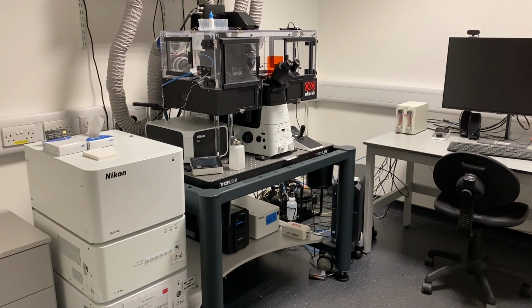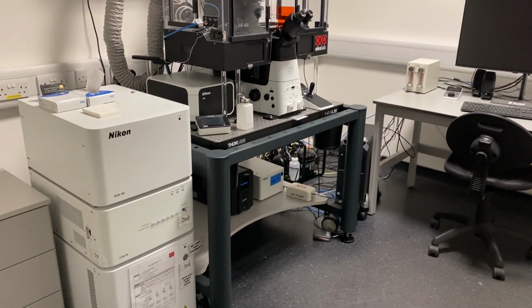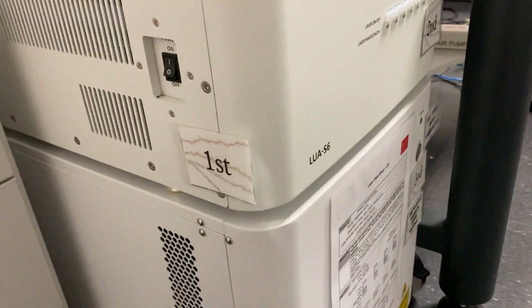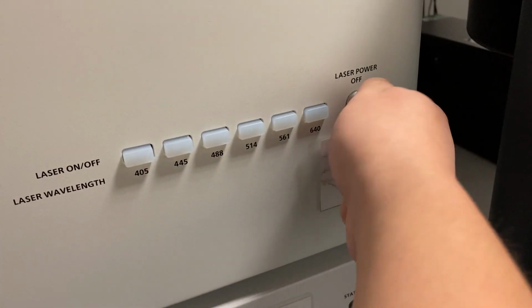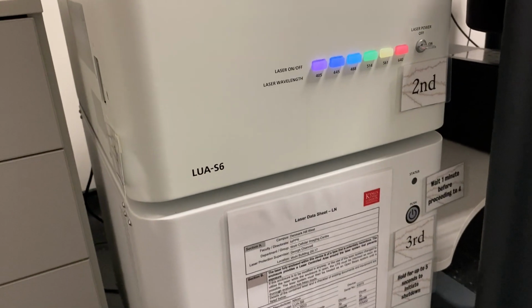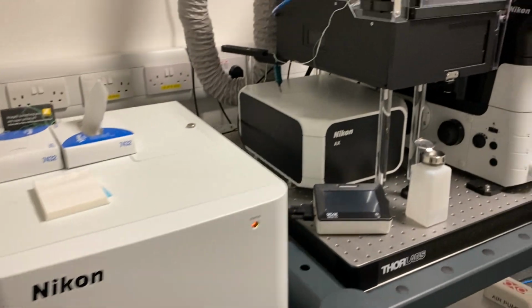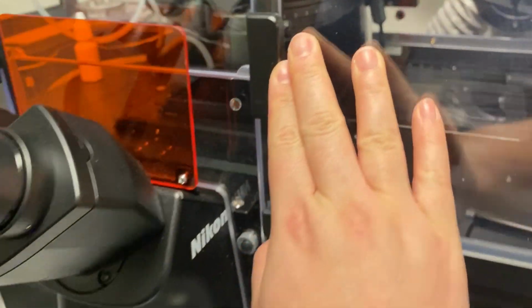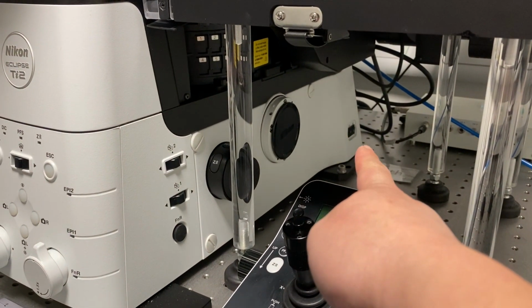This is an instruction video on how to switch on and set up the AX confocal. First, you want to switch the system on according to the numbers. Wait a few seconds between 1, 2, and 3. And then you want to check that the last user haven't left their samples inside before switching on the main body of the microscope, which is back here.